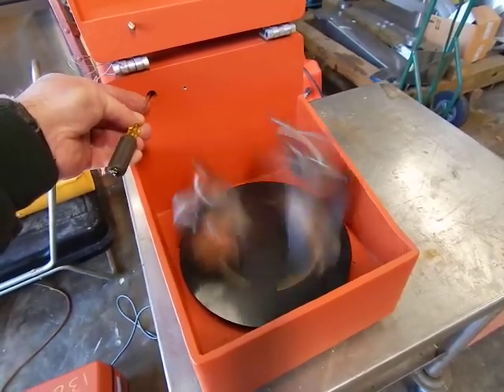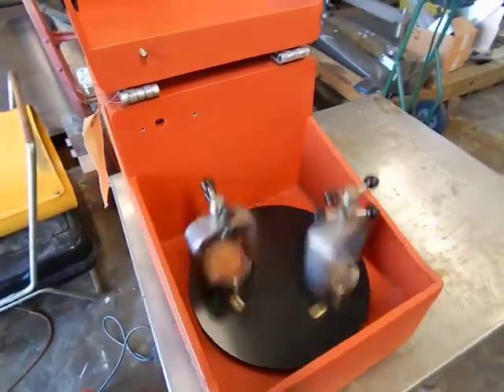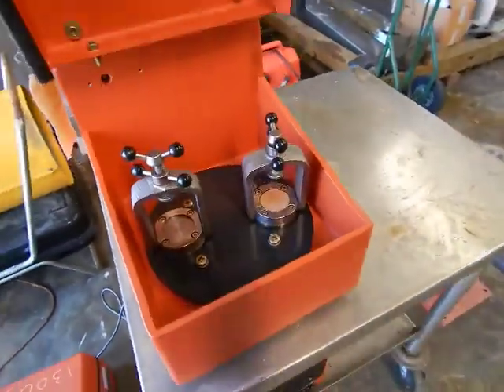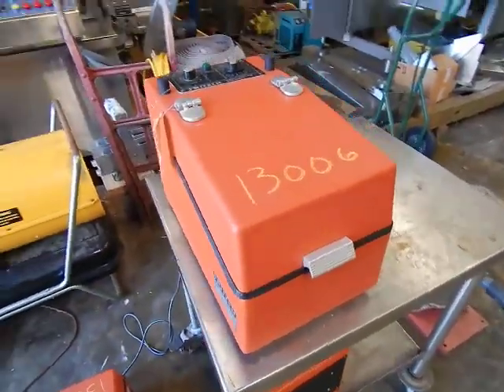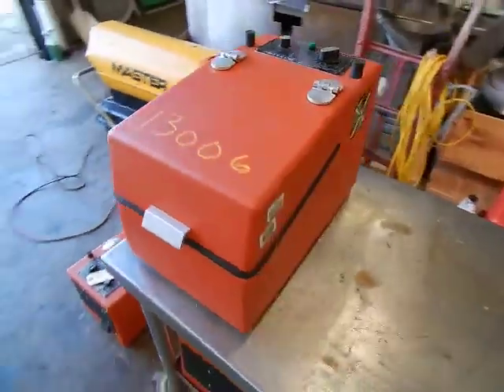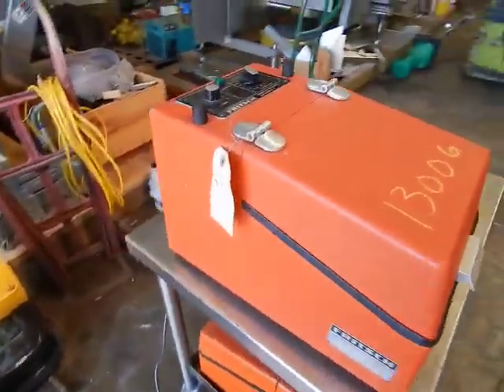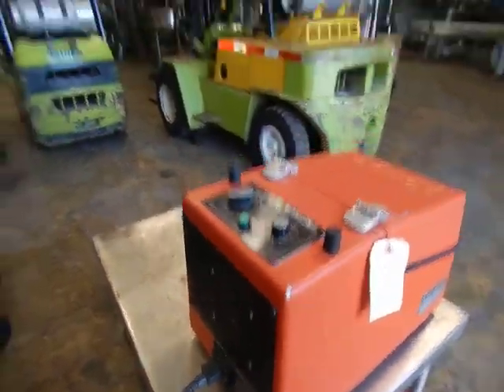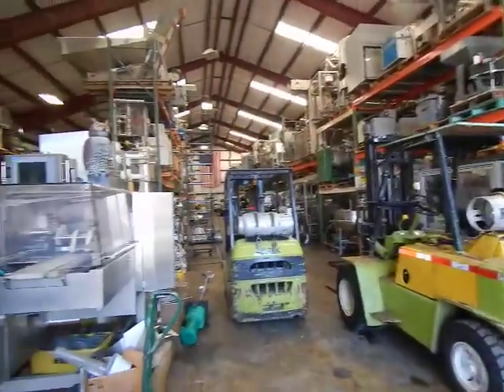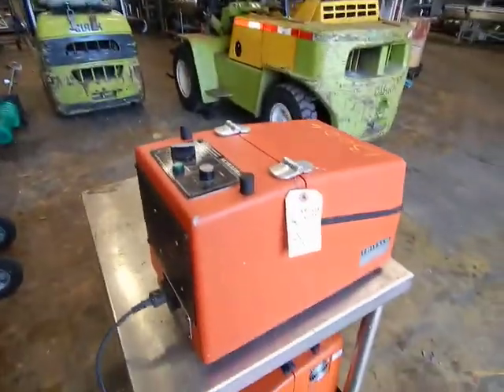Really nice — that's top speed right there. We're going to put this on YouTube so you can take a look at it. This is machine 1306 — very nice condition. We'll clean it up a little bit more of course; we're sitting here in the warehouse and they do get a little dust and whatnot with a lot of equipment in here.